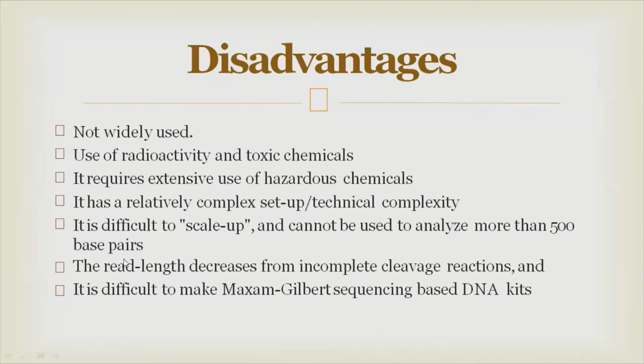In Sanger's, you can go on sequencing because it's a replication type of reaction that is happening. But over here, you'll be taking a fixed size of DNA into your reaction tube and then just adding the chemicals which will degrade that DNA template. The read length decreases from incomplete cleavage reaction.